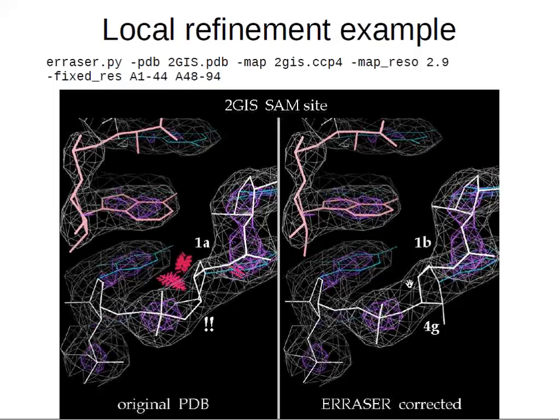And also get legal backbone conformation. Oh yes, yes. Because it did change the pucker. It's fixed the suite too.